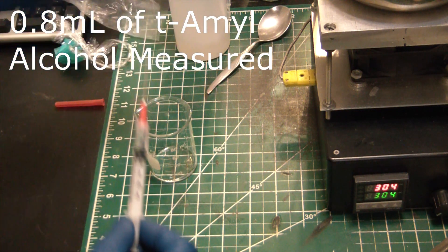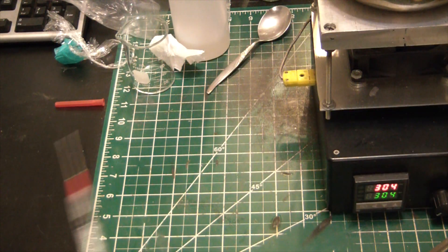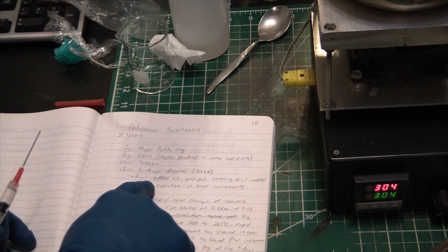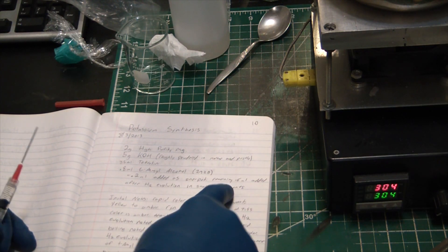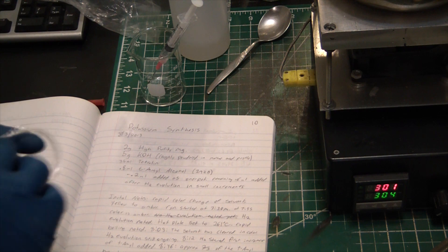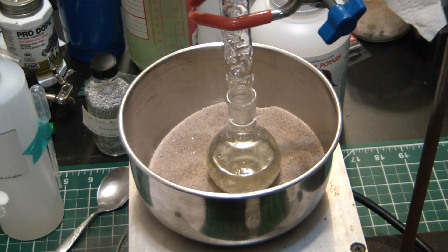Alright, there's exactly 0.8 mils. And now I'm going to inject a small amount. Looks like in my successful reaction I injected 0.2 to start and then added the remaining 0.6 out of the total of 0.8. And then we'll add the remaining in a little bit.